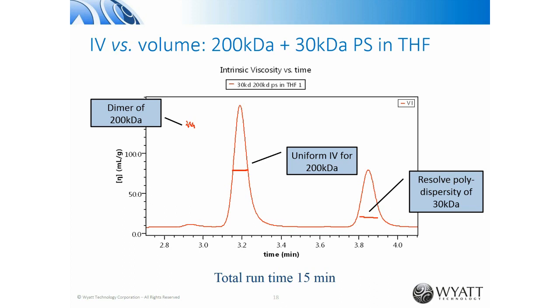So now we have the ability to get beautiful intrinsic viscosity measurements for not only standard chromatography, but APC and UHPLC. And with that, I'm going to hand the conversation over to Dr. Chris Deng, who's going to go into more detail about some of the interesting polymer physics and polymer science that you can do with this instrument.